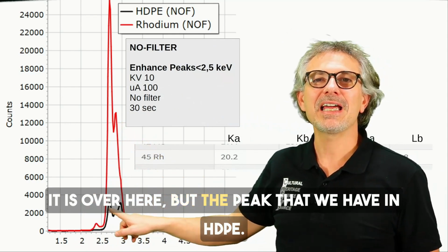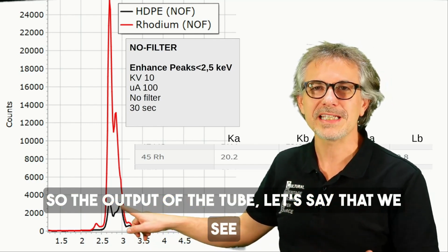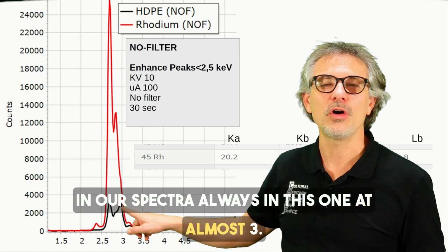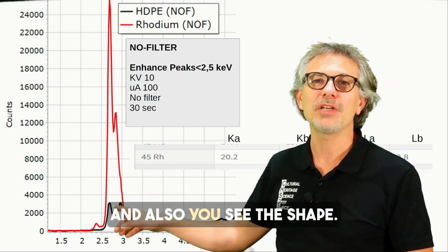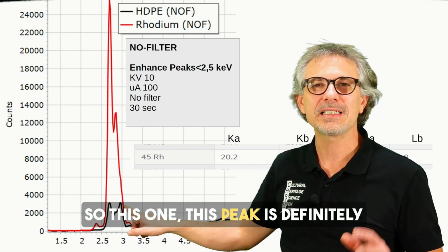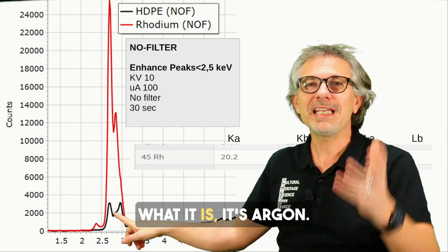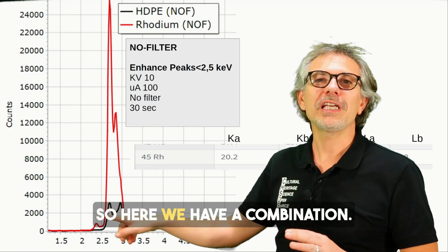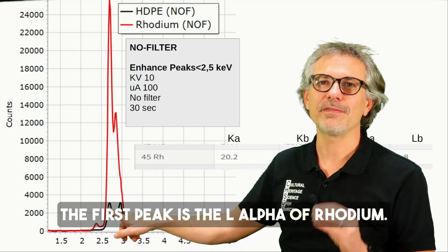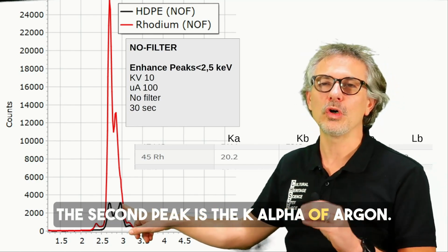But the peak that we have in HDPE, so the output of the tube, let's say, that we see in our spectra always, in this one at almost 3, this one is another thing. And also you see the shape, this one is much more intense. So this peak is definitely not the L beta of rhodium. What is it? Argon. So here we have a combination. The first peak is the L alpha of rhodium, the second peak is the K alpha of argon.